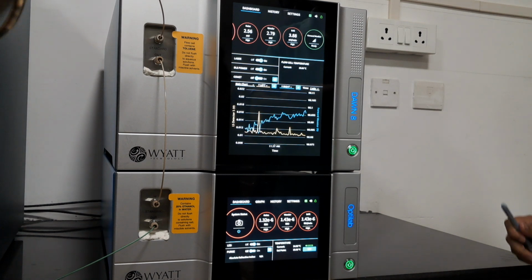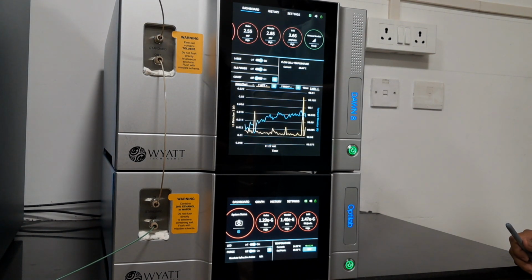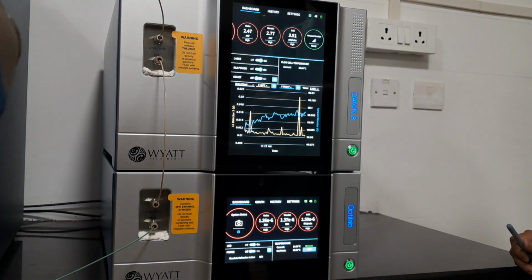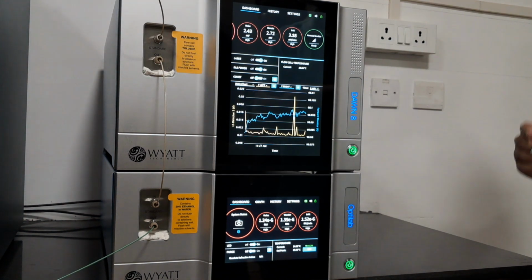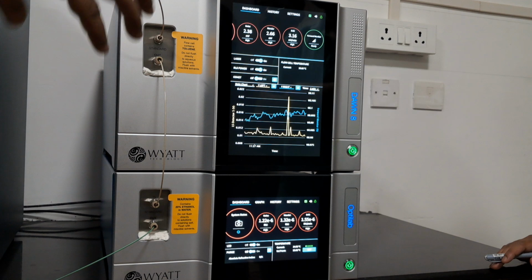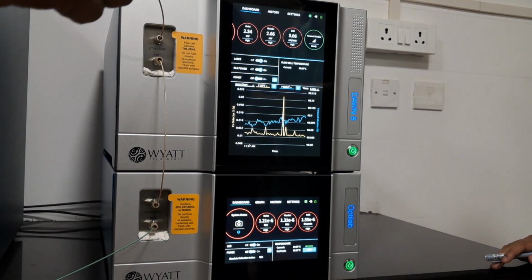No, it depends on your method actually. Anyhow, you are doing the research. So my BSA and these things will run with certain defined parameters. My flow rate is 0.5, I am using it. But the general washing step does not depend on the sample, right? You are using the mobile phase, and then you are going to run your analysis, correct? That method has some flow rate.